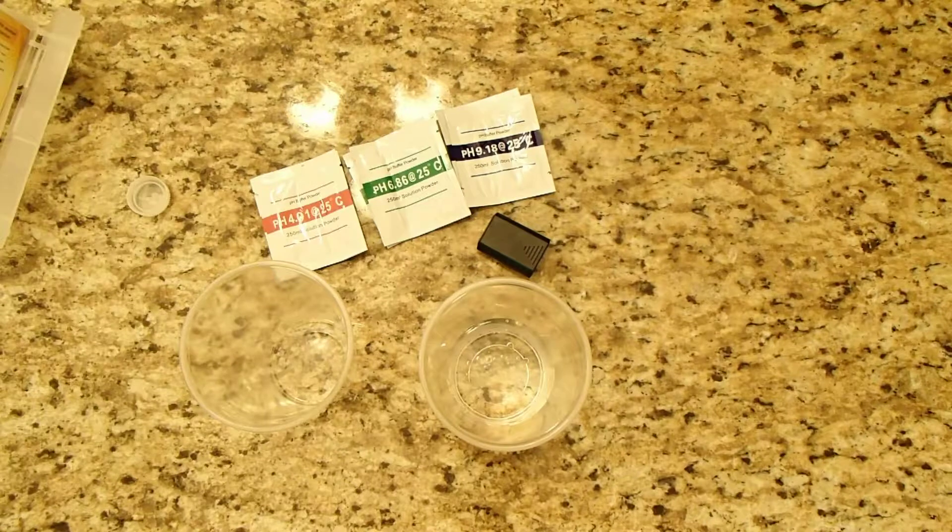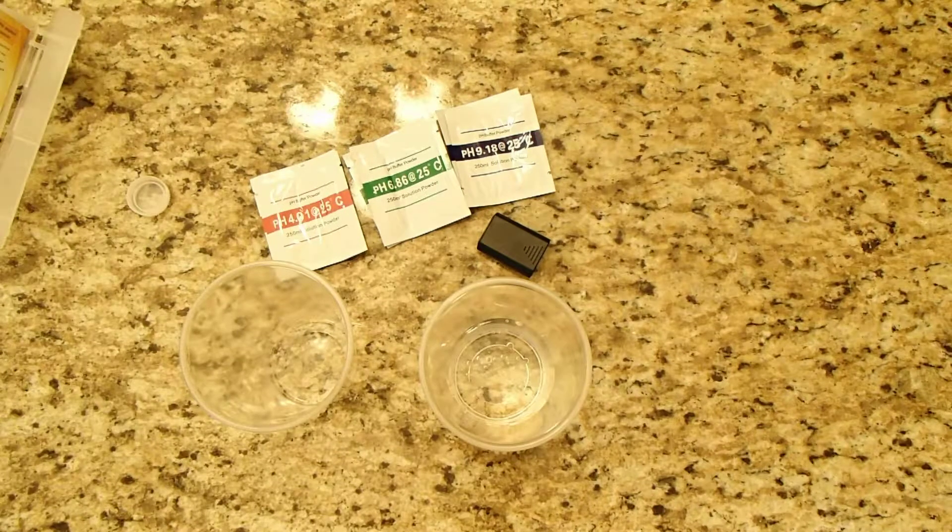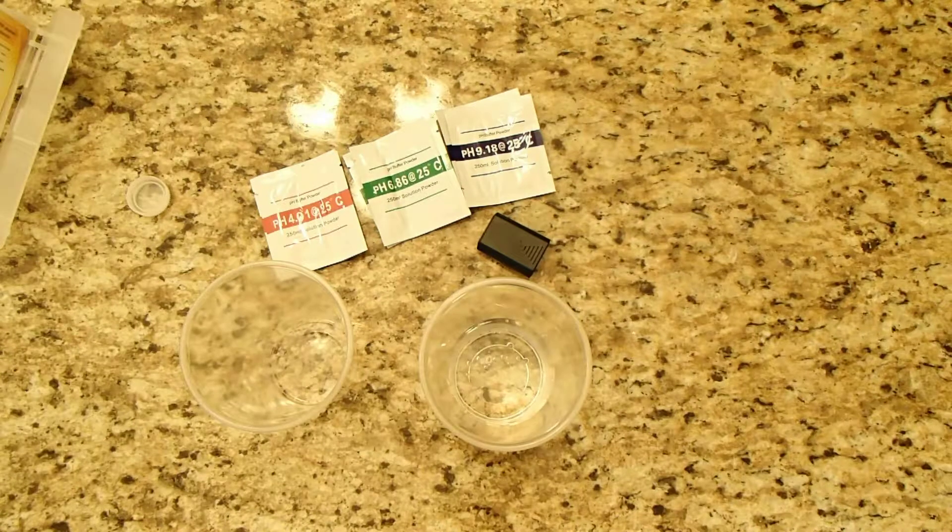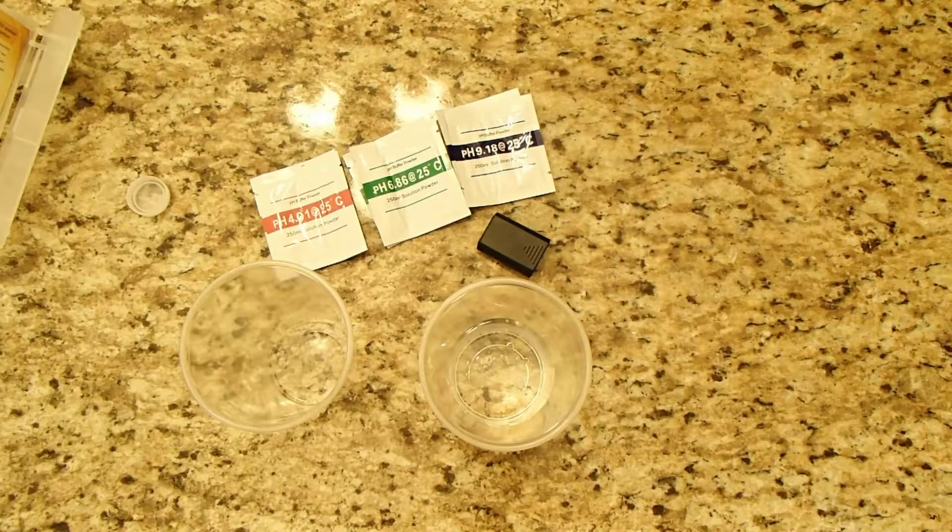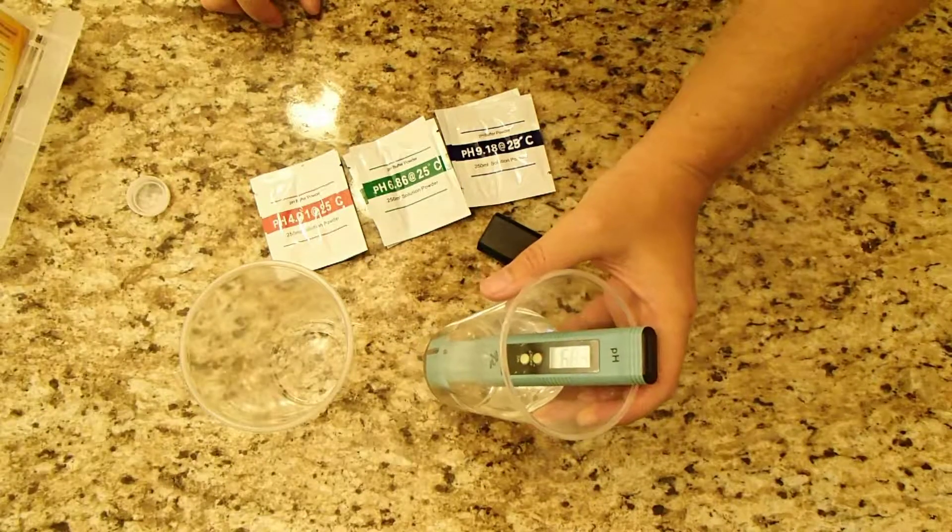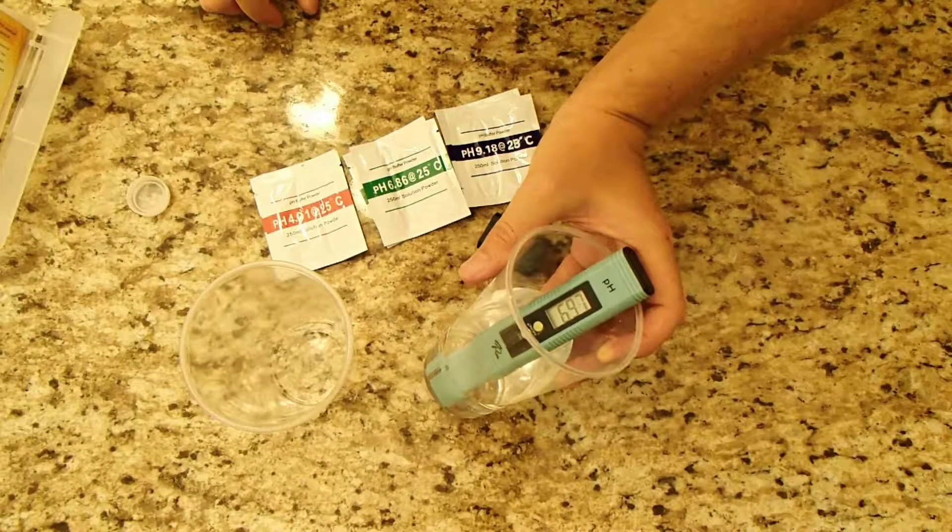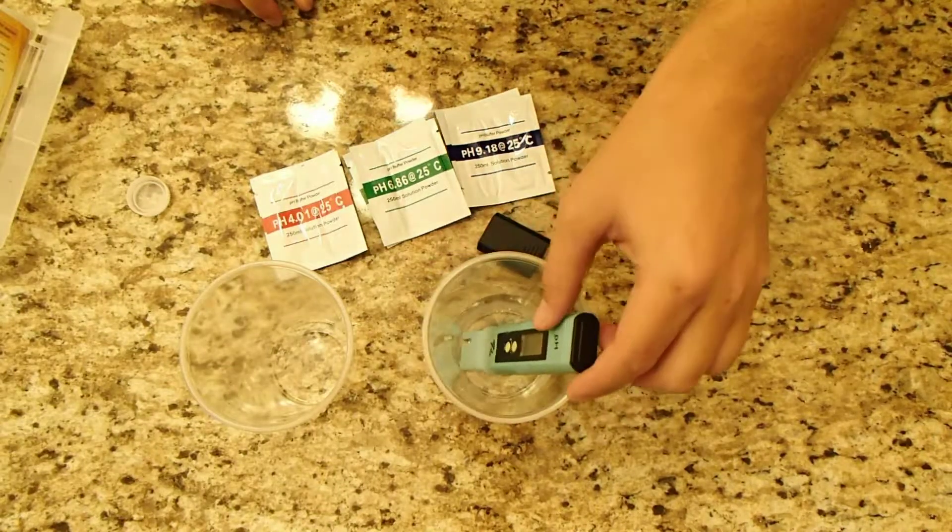I'm going to go ahead and just rinse it with some regular bottled water. No, it's not going to be dried. No, it's not going to be completely sterilized and properly calibrated. But what the heck. Filtered water still comes in about 6.6. A little bit higher, 6.9. Odd.